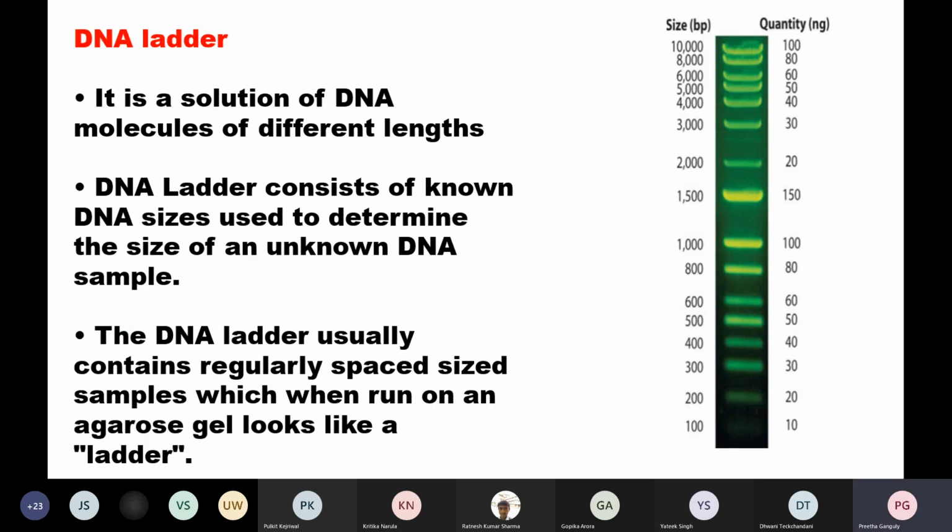Now, what is DNA ladder? How will you quantify the DNA? Till now we have seen that the DNA fragments have been separated, but how will we know what the particular size of the DNA is? How many base pairs are present? So for that we use a DNA ladder.